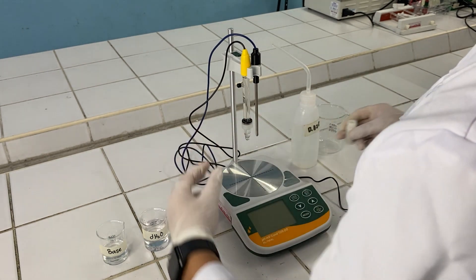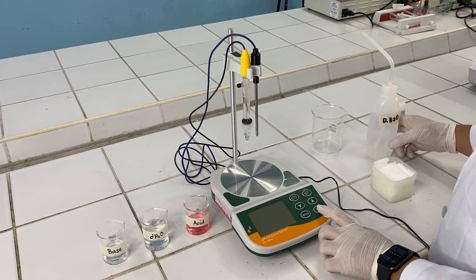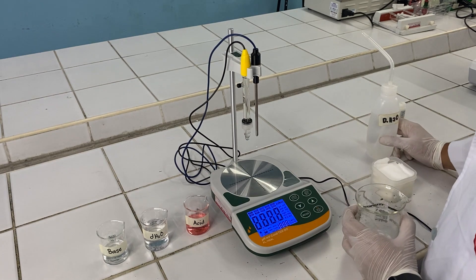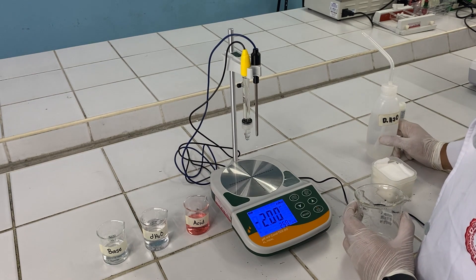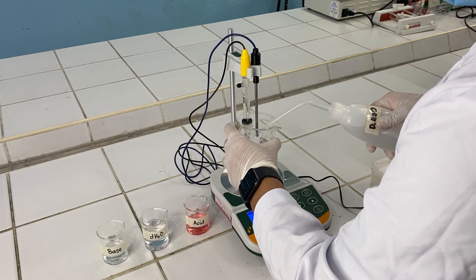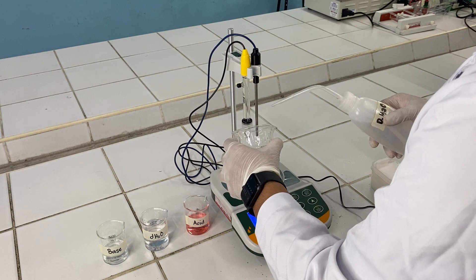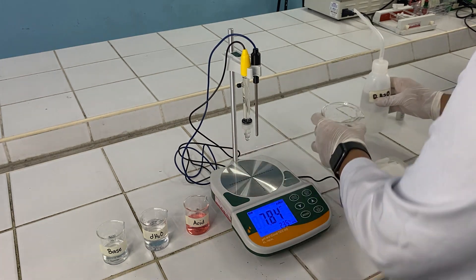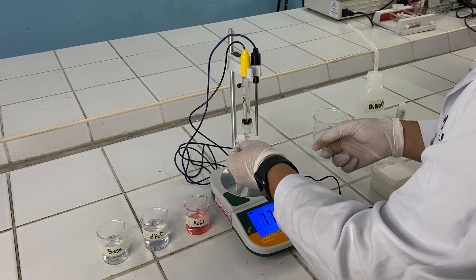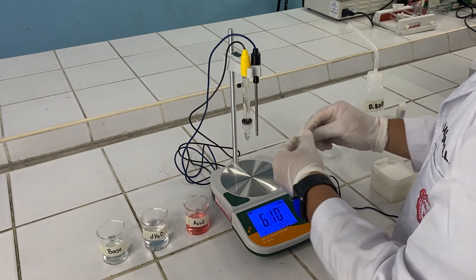Next is to uncap your electrode. Then, wash it with distilled water. Wipe the electrode very carefully, including the temperature rod.